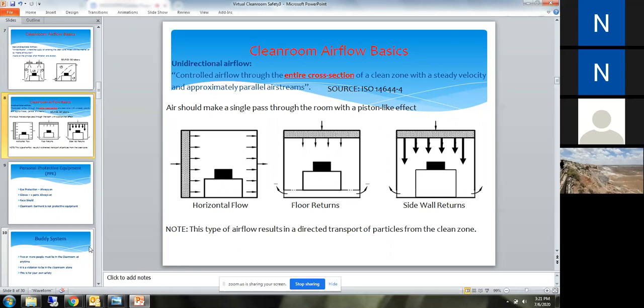So actually, this is another question regarding the clean room types. What are the different types of clean room again? What kind of different types of clean room are now available? There are many different, but I highlighted two. The first one was the ballroom design, which is one big room with everything in it. You have your equipment, and if your equipment is hooked up to a nitrogen gas cylinder, that nitrogen gas cylinder is right there in the clean room. So that would be a ballroom design.